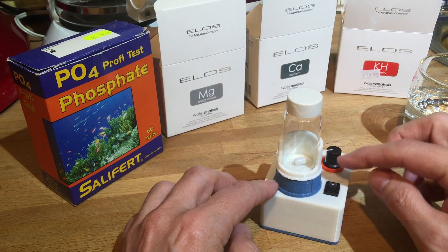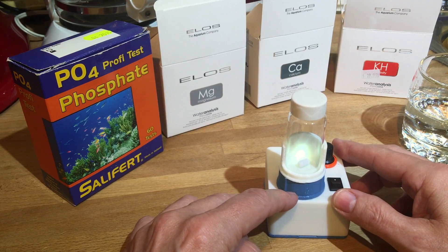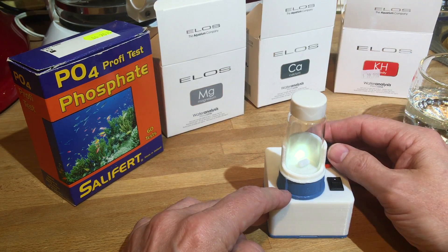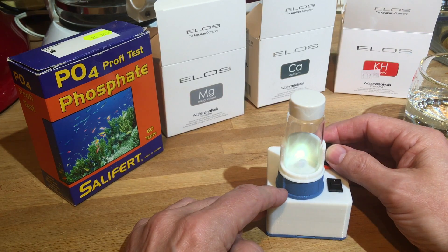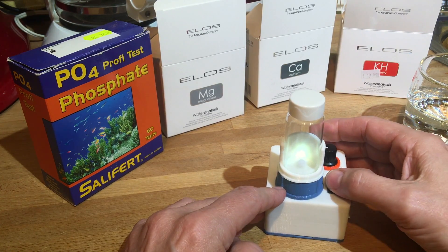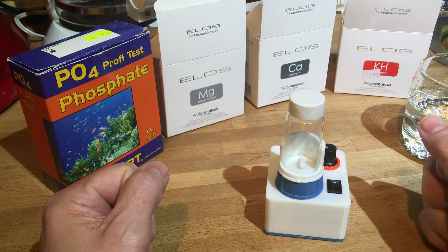There's a speed control — we'll turn it on and you can see the light behind it. I think that might be practical when you're doing water tests because it's a white background and the light from behind gives you a good view. Pretty cool, right? So I thought we'll do an alkalinity test first.